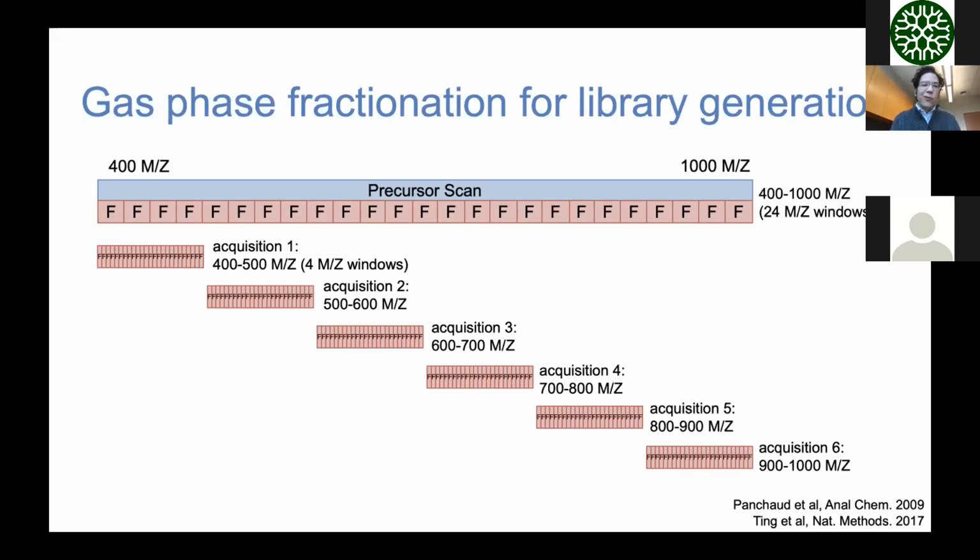I think one challenge of trying to use ion mobility is that ion mobility is so commonly associated with precursor mass that it may not get you as much orthogonal separation as precursor mass would in these cases. It just does essentially the same type of thing as the quadrupole in the front of your instrument. In many cases, but there may be some circumstances where trying to use ion mobility to do gas phase fractionation is a sensible approach, and it is definitely a possible approach to consider.